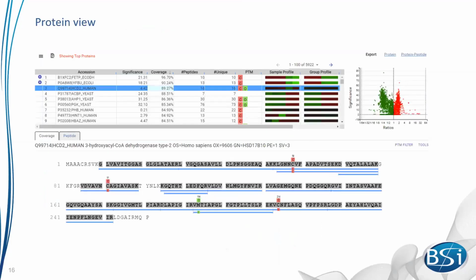And here is a snapshot of the label-free quantification with those standard data sets, like a mixture, showing they give really good quantification results.